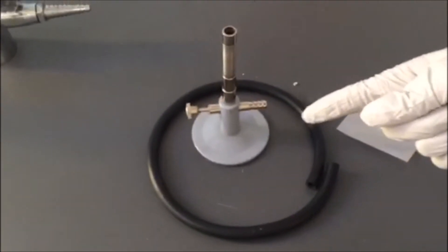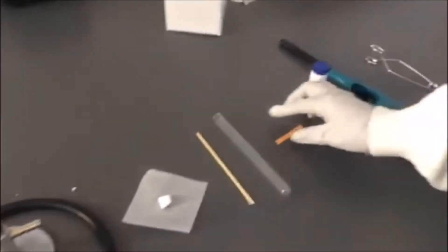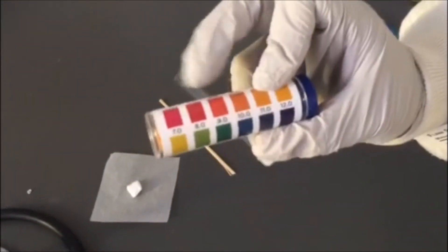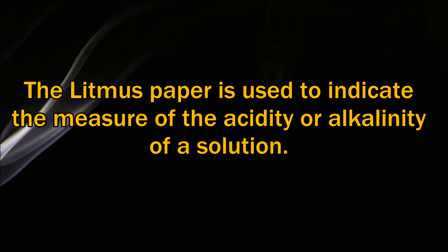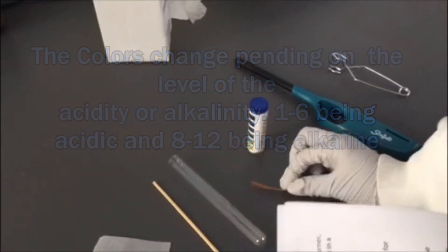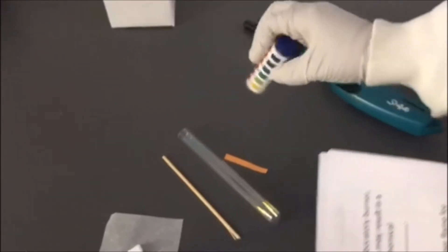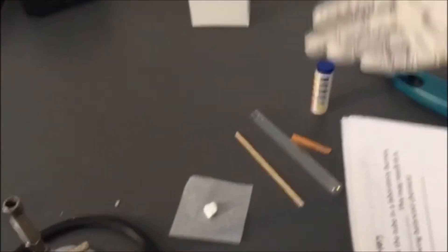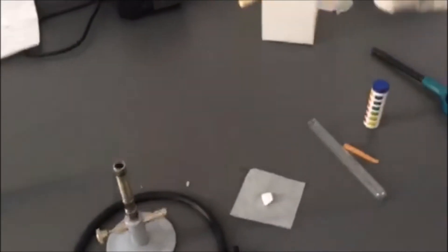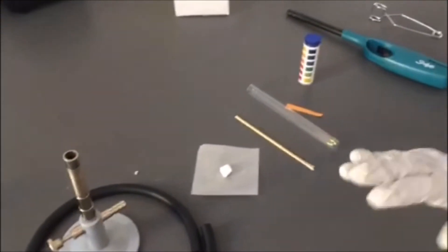We're going to turn it on for 30 seconds, and then we're going to remove the test tube. We're going to place a litmus paper — which is this — and check what color it comes out in. We're going to place it on top of the test tube and it's going to change to one of these colors. After that, we're not going to smell it, but we're going to waft it. Then with this little toothpick right here, we're going to burn it and put the flame inside the test tube.